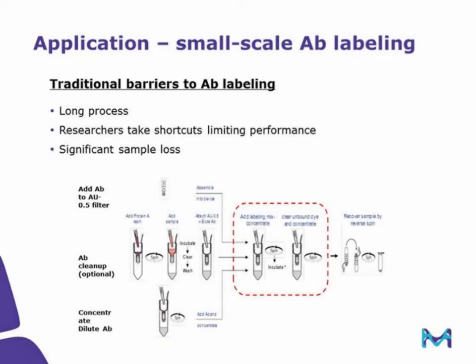Protein immunodetection encompasses a broad range of analytical methodologies, including Western blotting, flow cytometry, and microscope-based applications. These assays rely upon fluorescent or chemically tagged target-specific antibodies. Commercially tagged antibodies are available but are costly, and not every color is available. Kits for labeling exist as well, but these possess issues which are barriers to researchers doing their own antibody labeling.